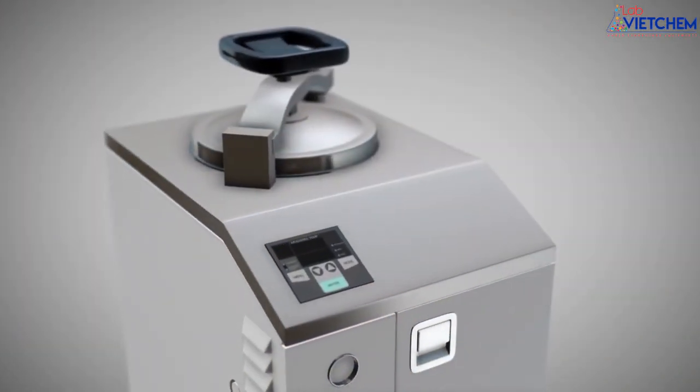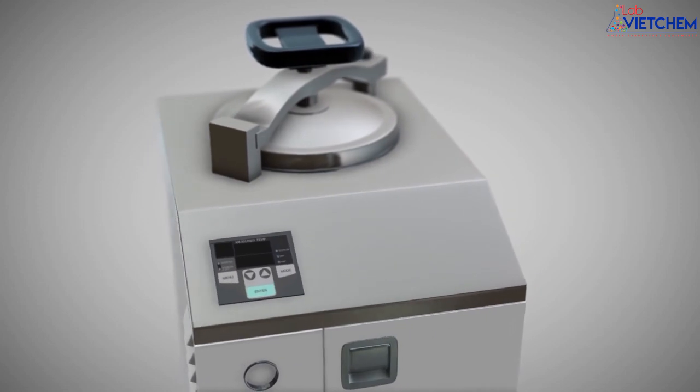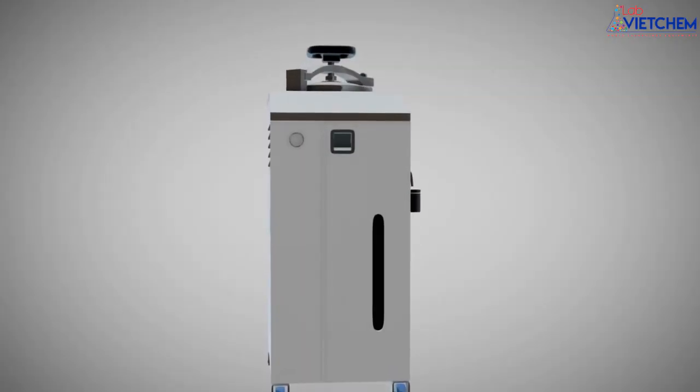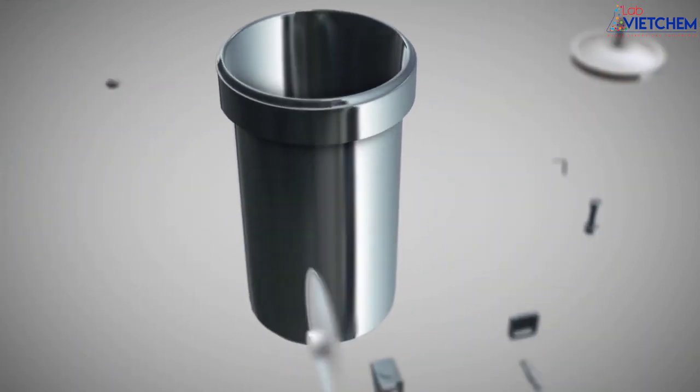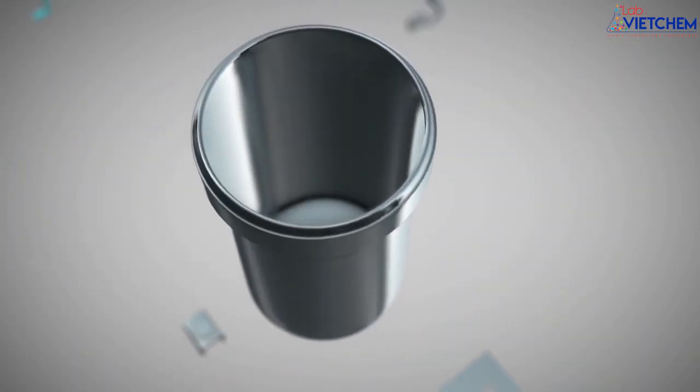So how do we sterilize materials in the lab? We use a device called an autoclave. Basically, an autoclave is a powerful pressure cooker that uses heat, steam, and pressure to destroy microorganisms.